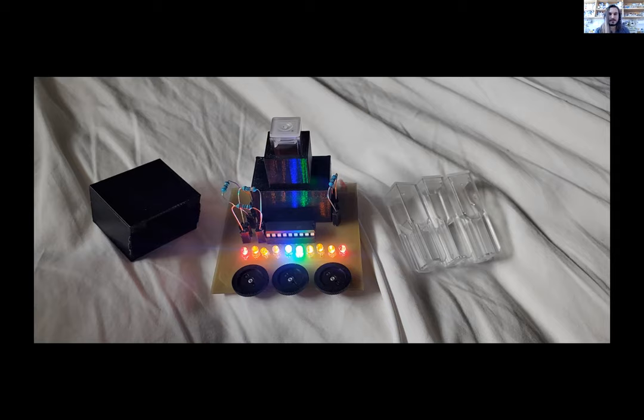Like there's literally nothing else that will actually drive a diode, a photodiode, and read its voltage and give you some type of a visual indicator without having a screen. And that theme of simplifying and the concept of better than nothing is turning into a really interesting design philosophy of not, because you're broke, you don't deserve good stuff. But it's like, if you have nothing, can you do science?